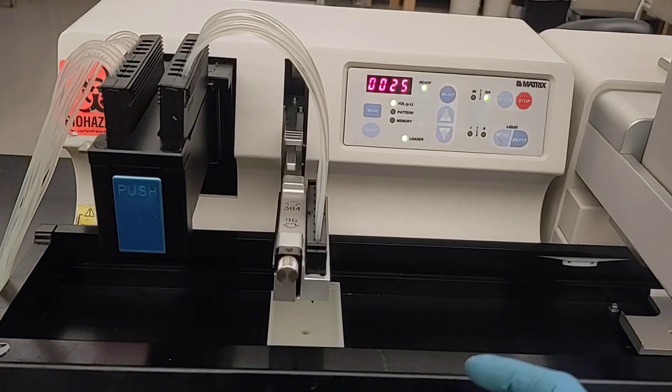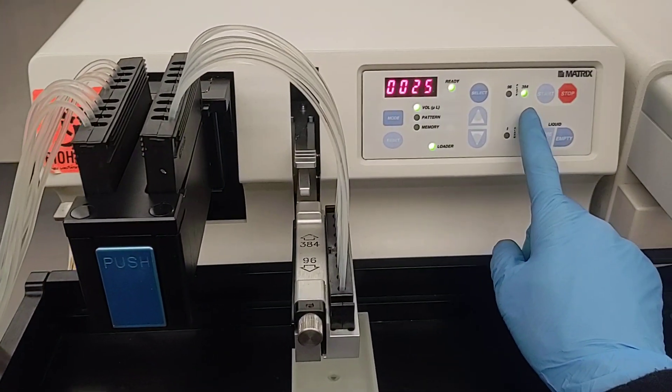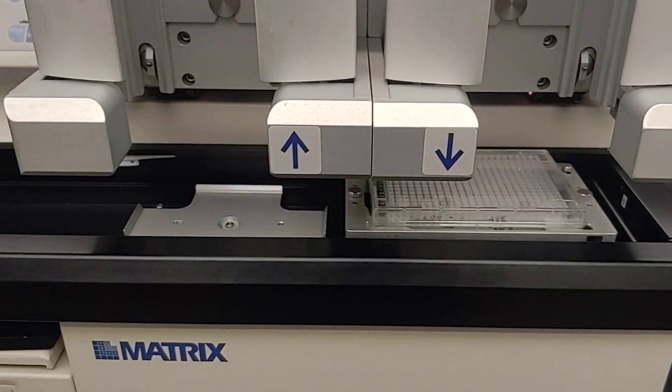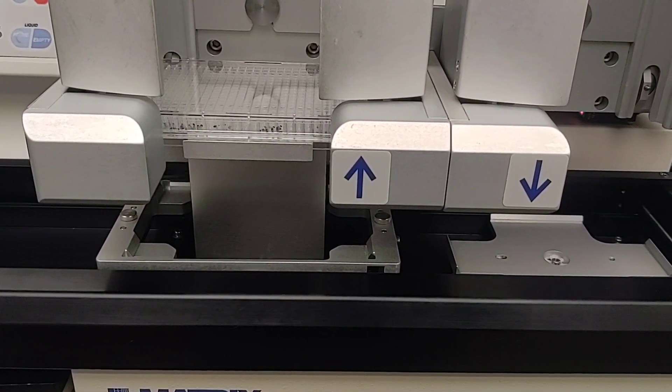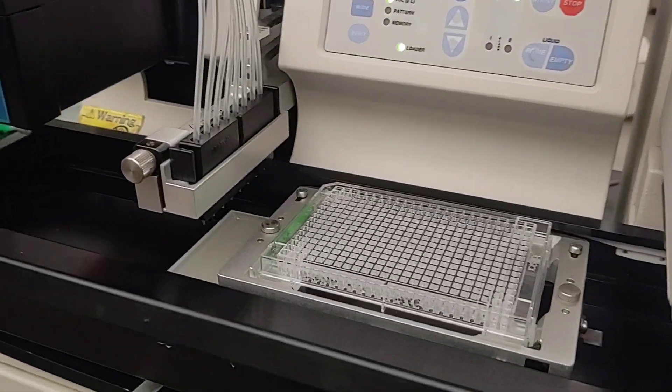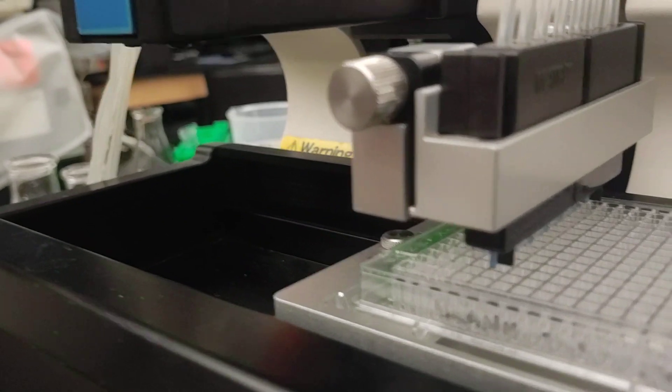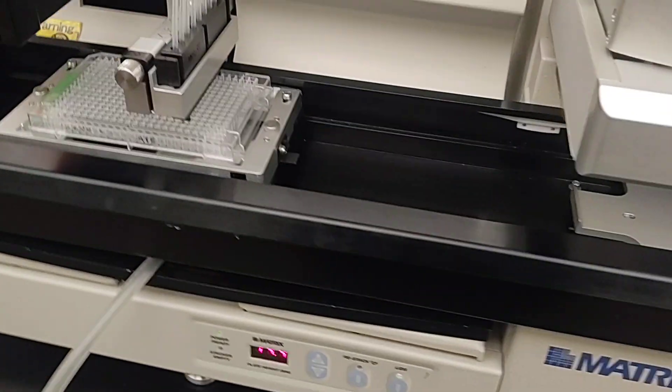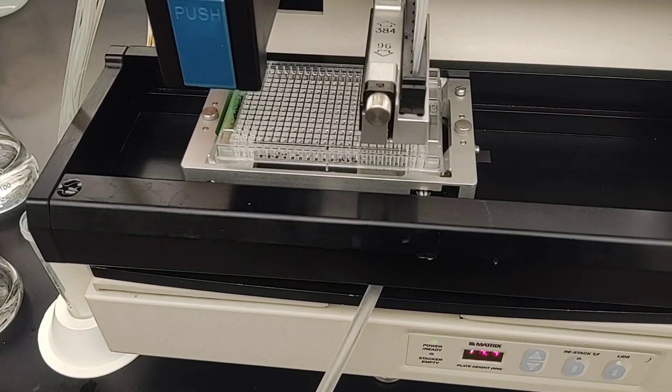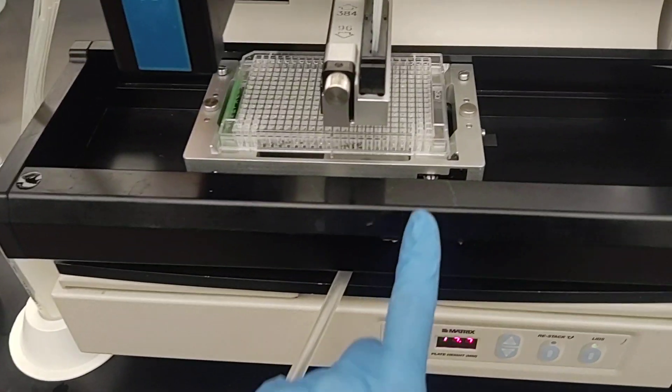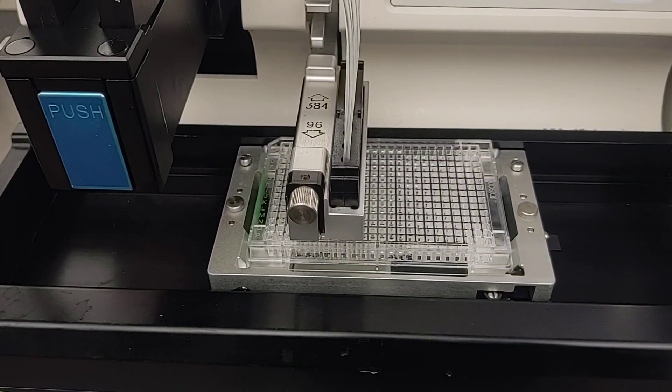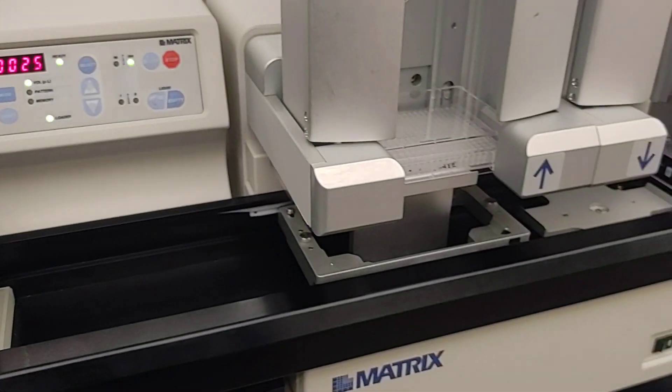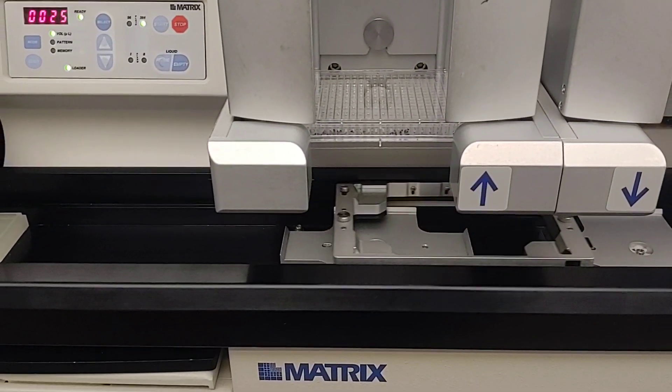And when we hit start, the plate carrier is going to come up, pick up the plate, and then it goes over here to drop off the lid if you have that activated. And then it comes over here to dispense. And it will continue to do so. The default for a 384 well plate is to not dispense into the last two wells since those are often used for controls. If you don't want it to be done like that, then you can use a different program from the memory. And it comes up here and drops off the plate and now has its lid back on.